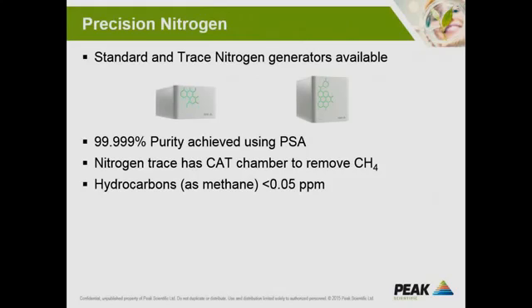And what we do here is we have a carbon molecular sieve column, which is pressurized using compressed air. During the pressurization process, we adsorb oxygen to the CMS, carbon molecular sieve material, and allow nitrogen to pass through to a buffer tank. Then when we depressurize the system, we release the oxygen and vent that to the atmosphere.